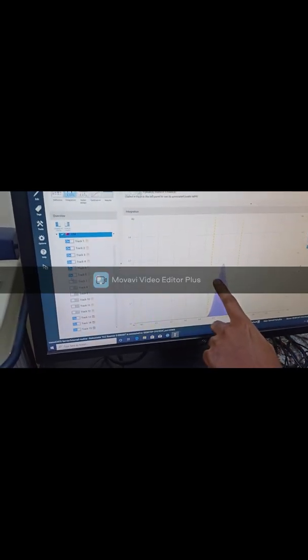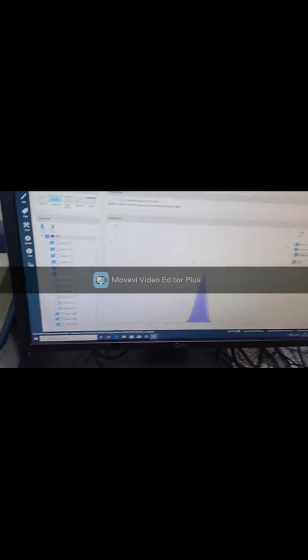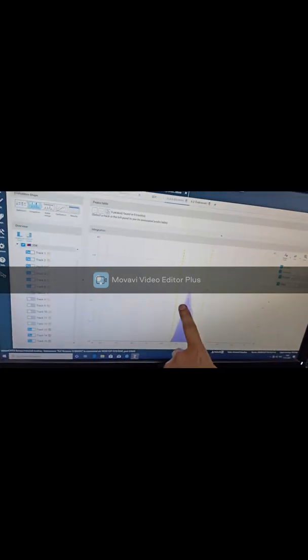You can see various peaks have come. We choose our window to this peak, and then move to the substance assignment section. There we bring the window near the peaks and adjust it, then press the eye button, and we will get the corresponding calibration plots.